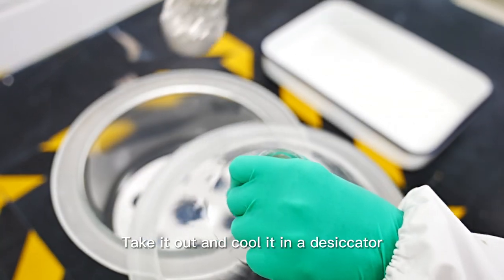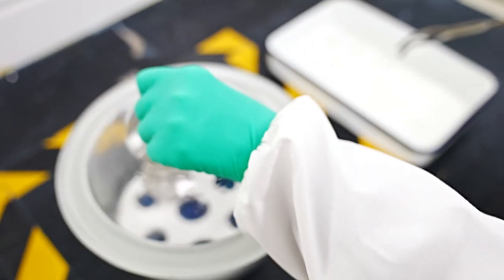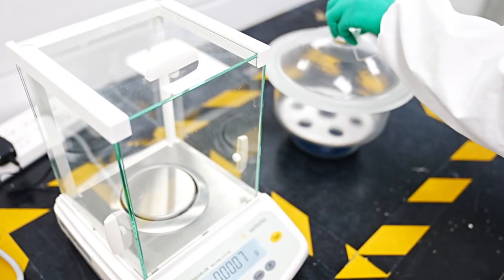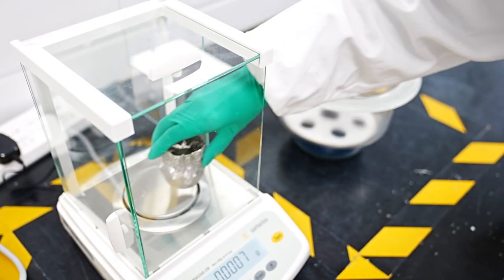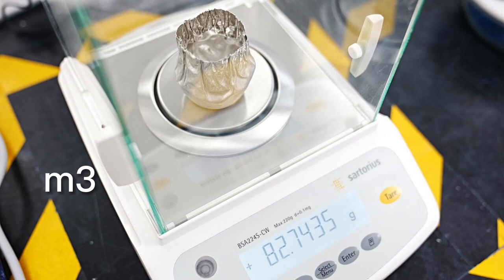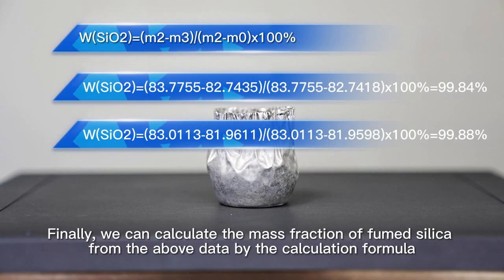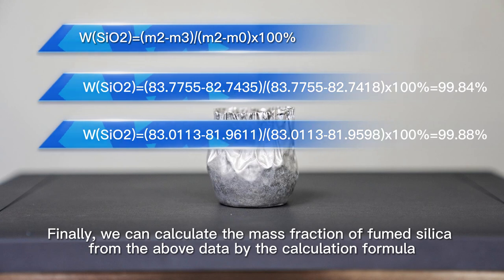Take it out and cool it in a desiccator. Weigh it M3. Finally, we can calculate the mass fraction of fumed silica from the above data by the calculation formula.